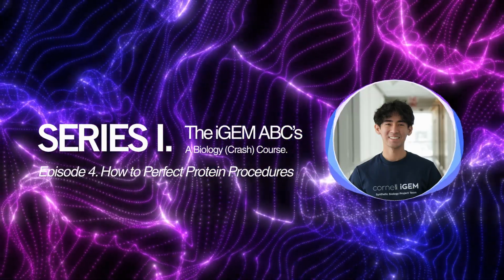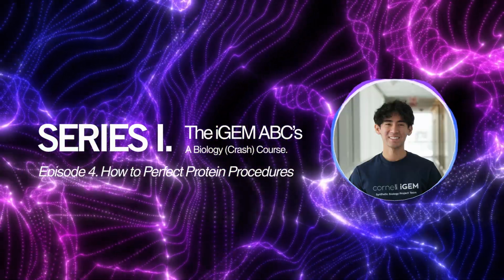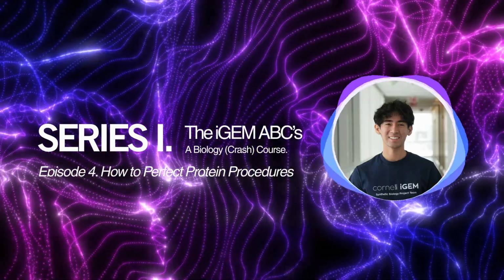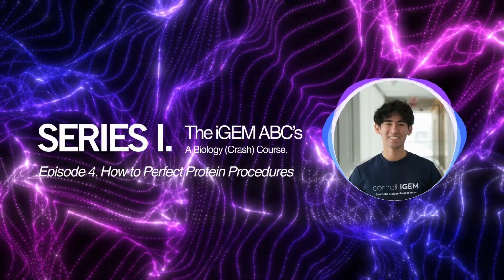Testing what we did to ensure success. Let's cover SDS-PAGE again, one of the most common protein analysis techniques you'll see in basically every iGEM lab. The idea behind SDS-PAGE is pretty elegant. You take your protein samples and mix them with SDS, which is a detergent that unfolds proteins and coats them with a uniform negative charge.